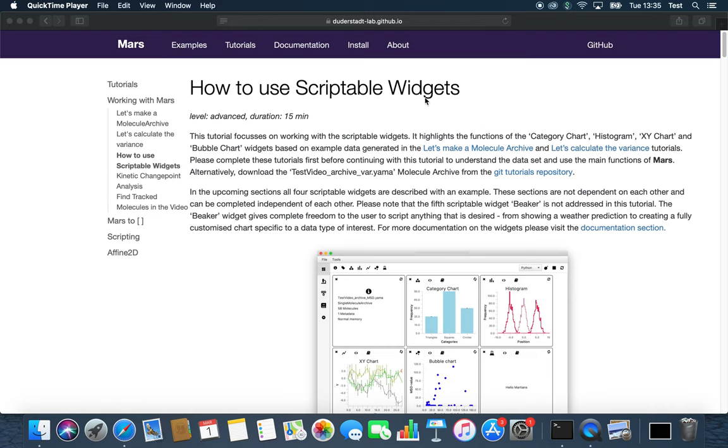Welcome back. In this tutorial we will focus on the option of creating scriptable widgets, which come in handy for getting a quick overview or simple analysis.